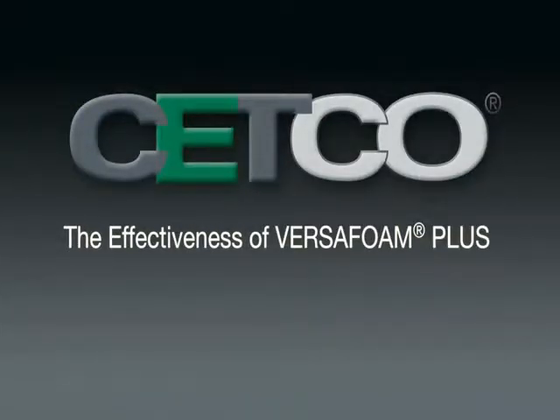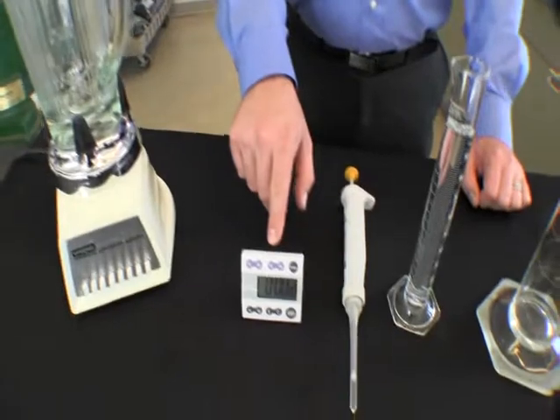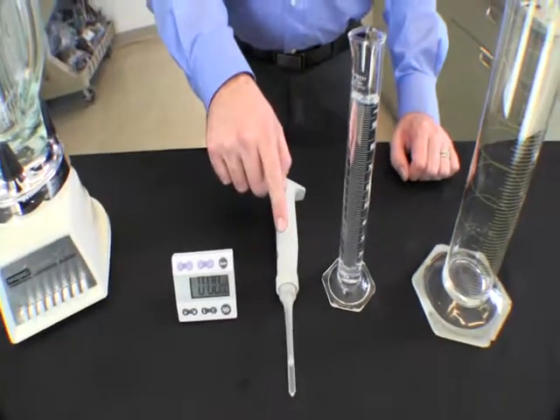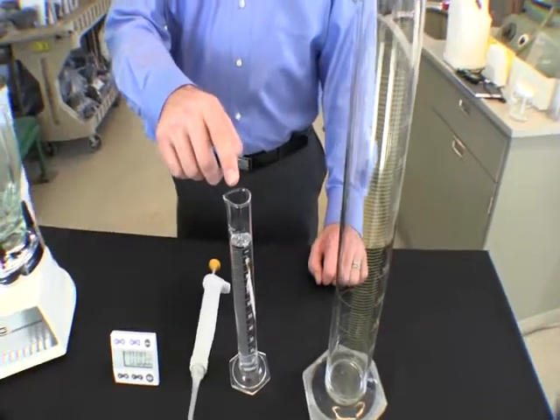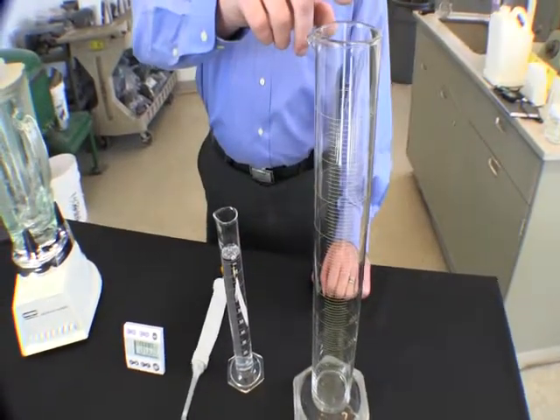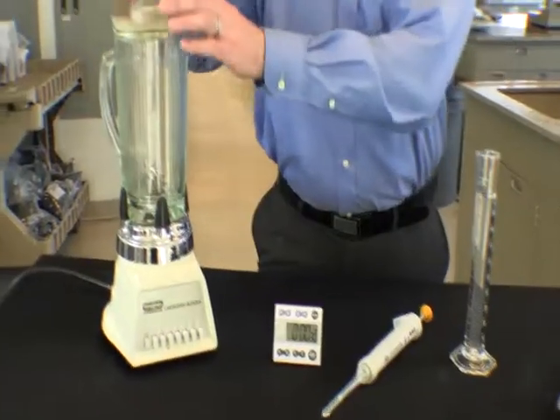For this demonstration we will be using the following items: a 7-speed warm blender with a clean glass chalice, a timer capable of indicating seconds, a pipette delivering 0.5 milliliters, 100 milliliters of room temperature tap water, and a clean 1000 milliliter graduated cylinder. First we remove the lid from the blender.